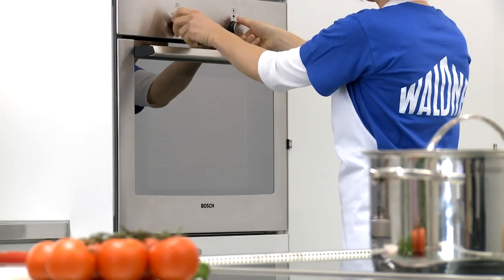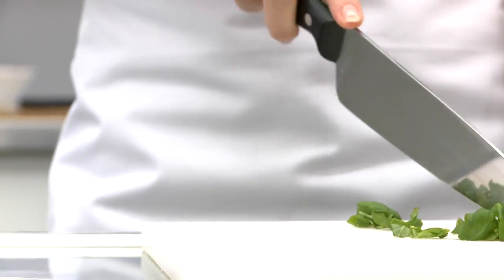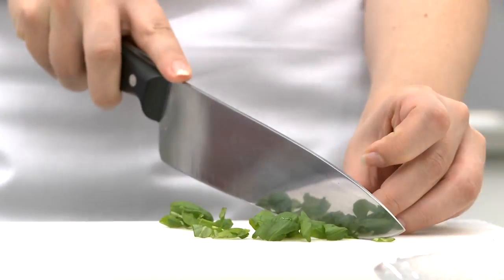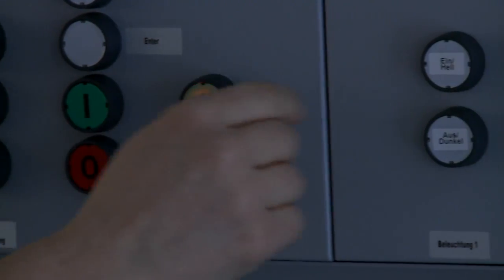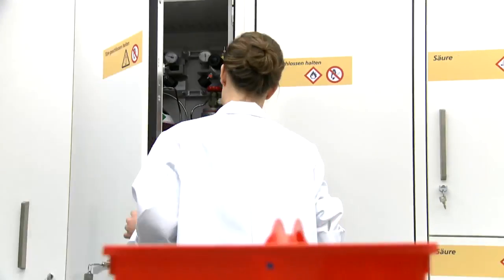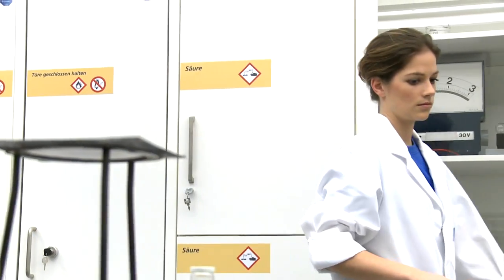Scala, the intelligent modular system for your school. You can rely on more than a hundred years of experience in production and innovation at Waldner's headquarters in the Allgäu region of southern Germany.